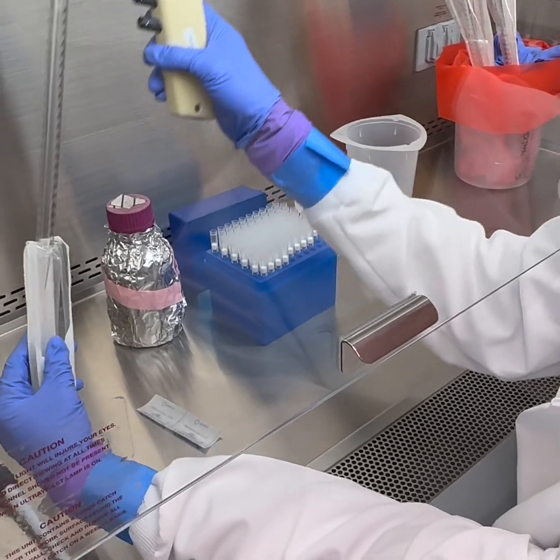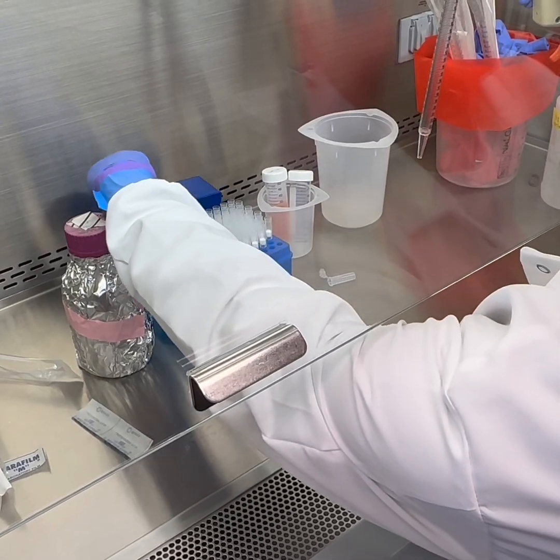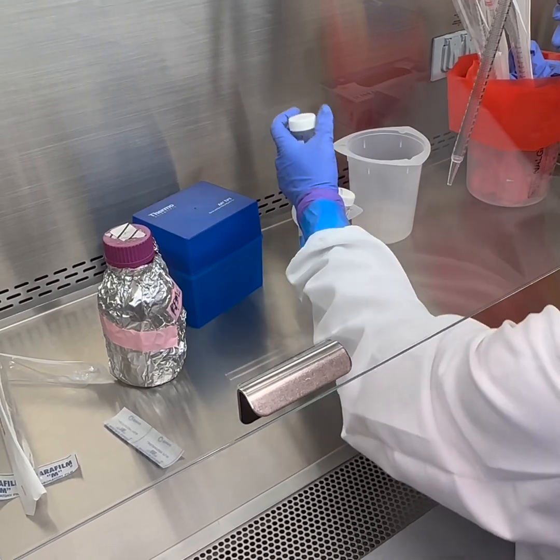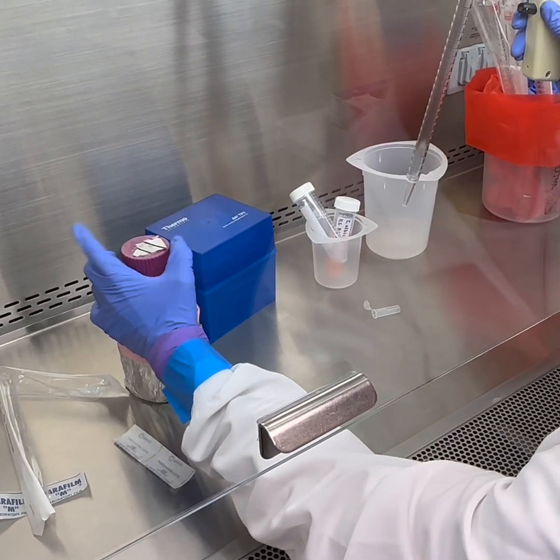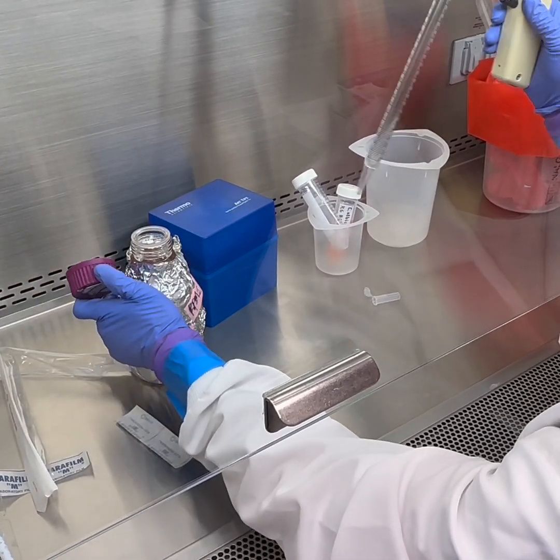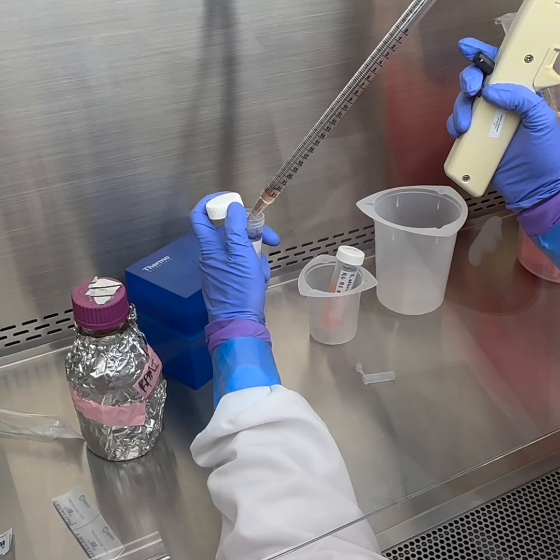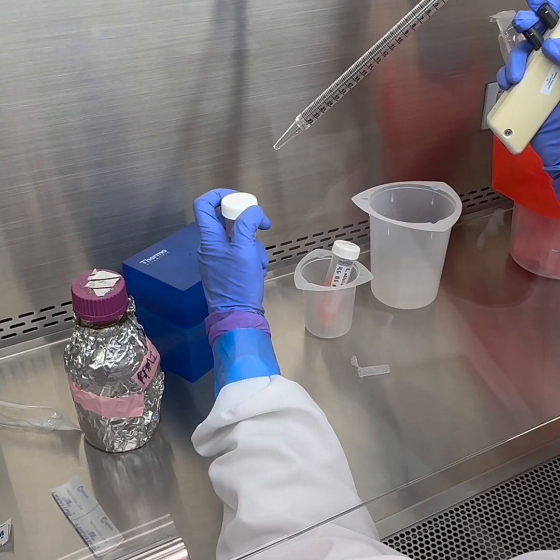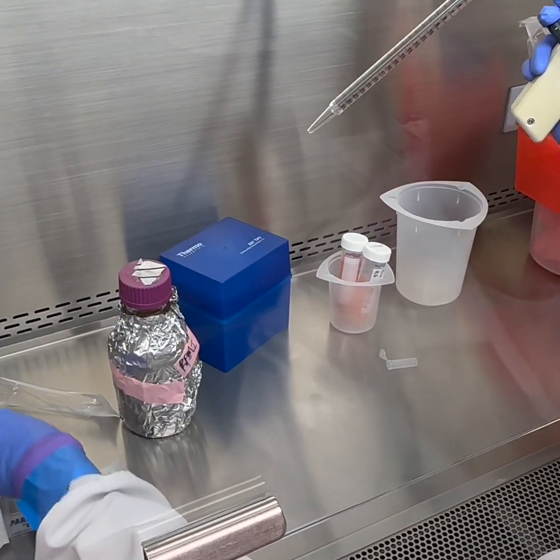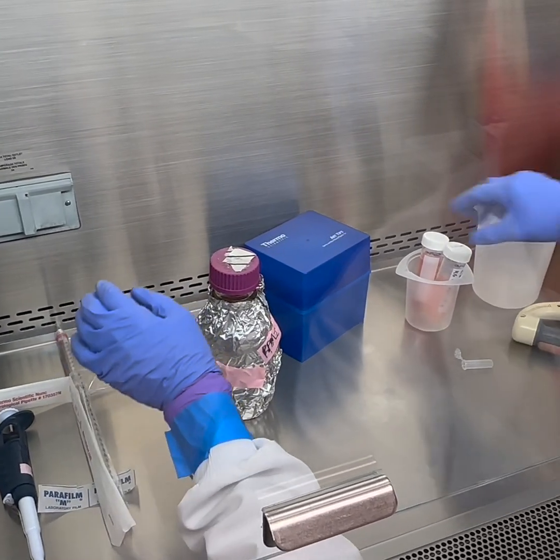So we're making our dilution to 1 times 10 to the 6th cells, 40 milliliters of that. I'm going to grab 40 milliliters of RPMI 1640 into a new conical. I'm going to save this for mixing purposes, so I'm just going to re-sleeve it right now and then we'll use it again in a sec.